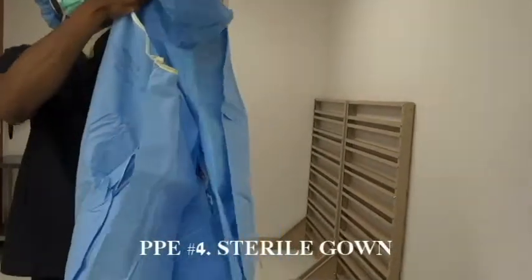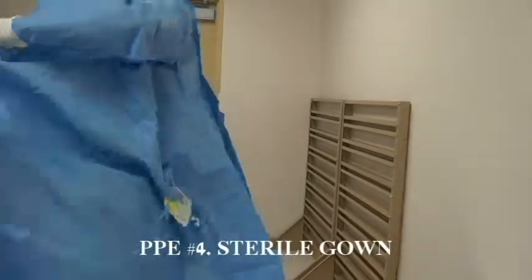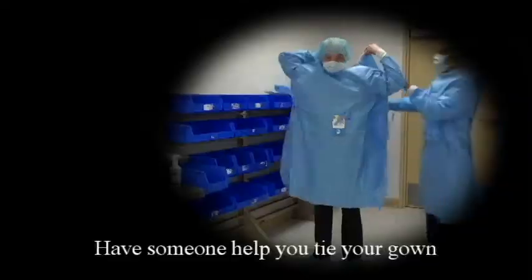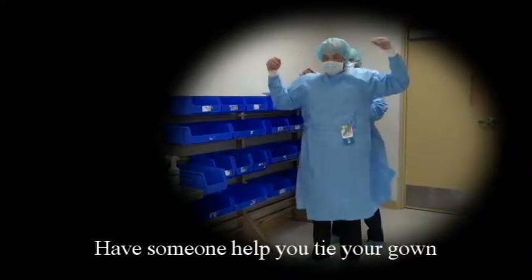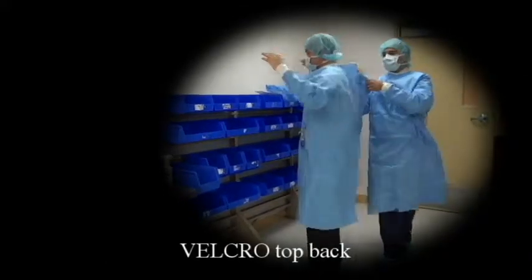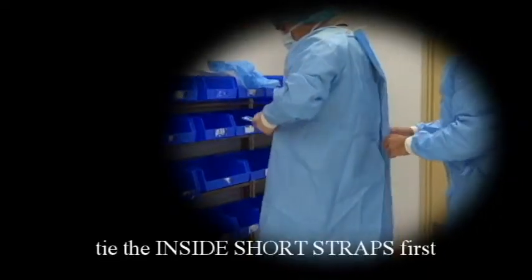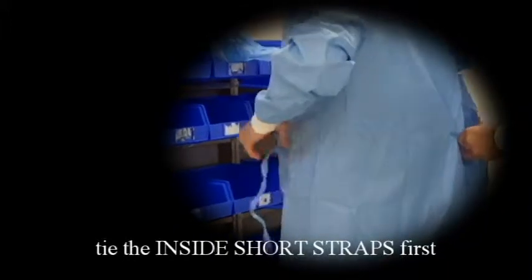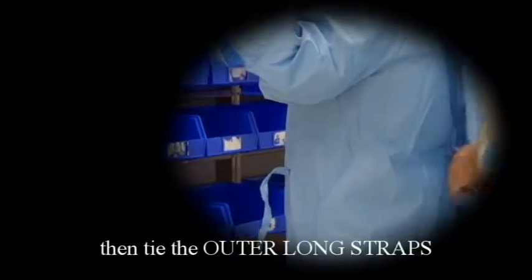Don sterile gown. Have someone assist you with the straps. Attach the velcro on the top back. Tie the inside short straps first, then tie the outer long straps.